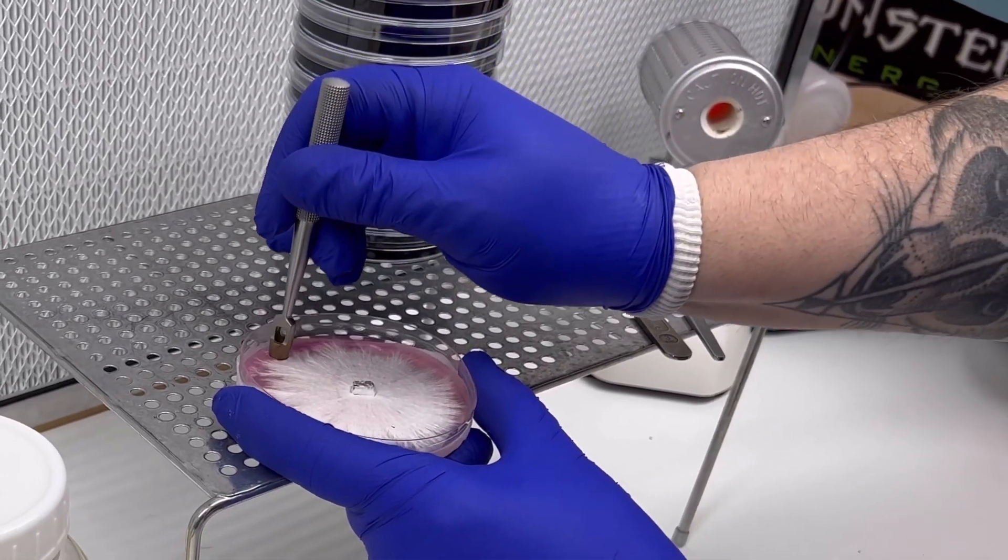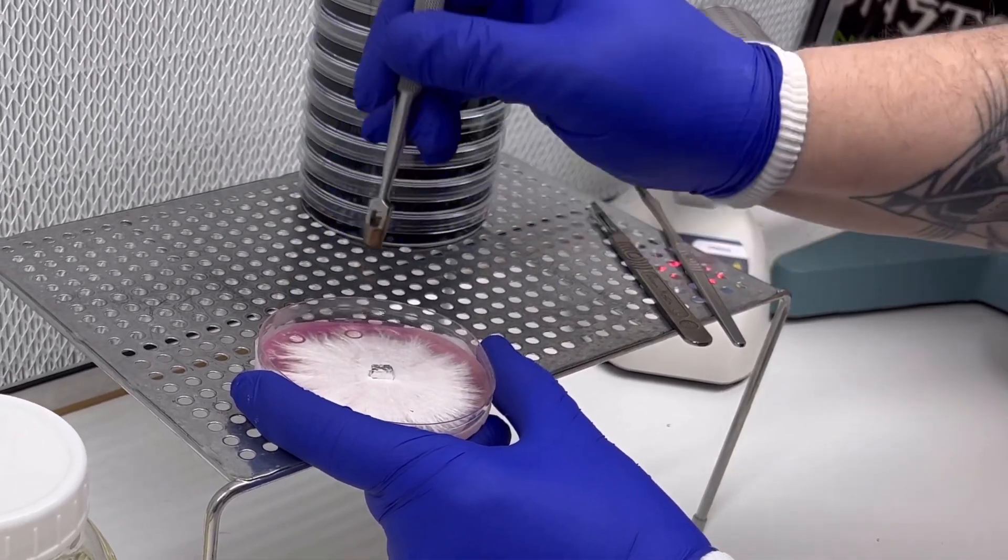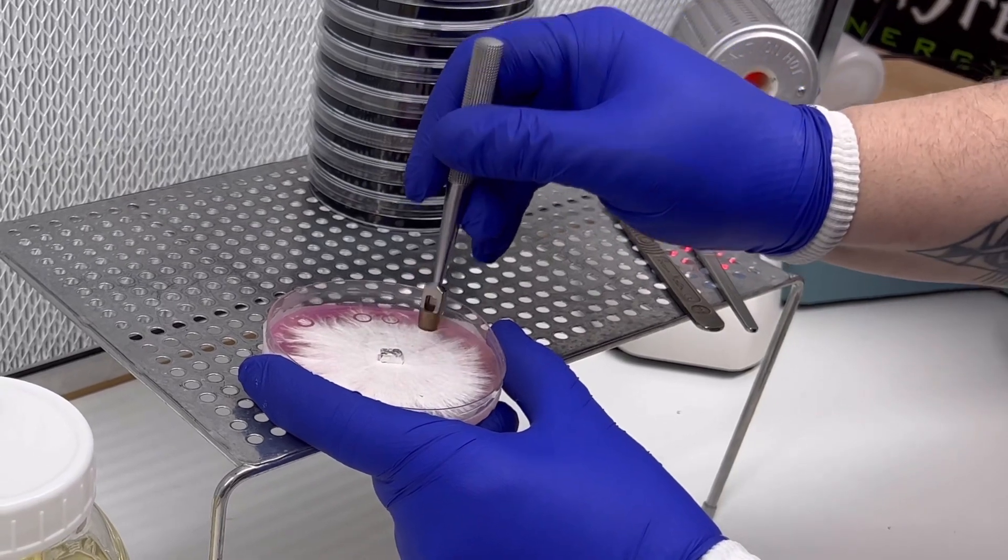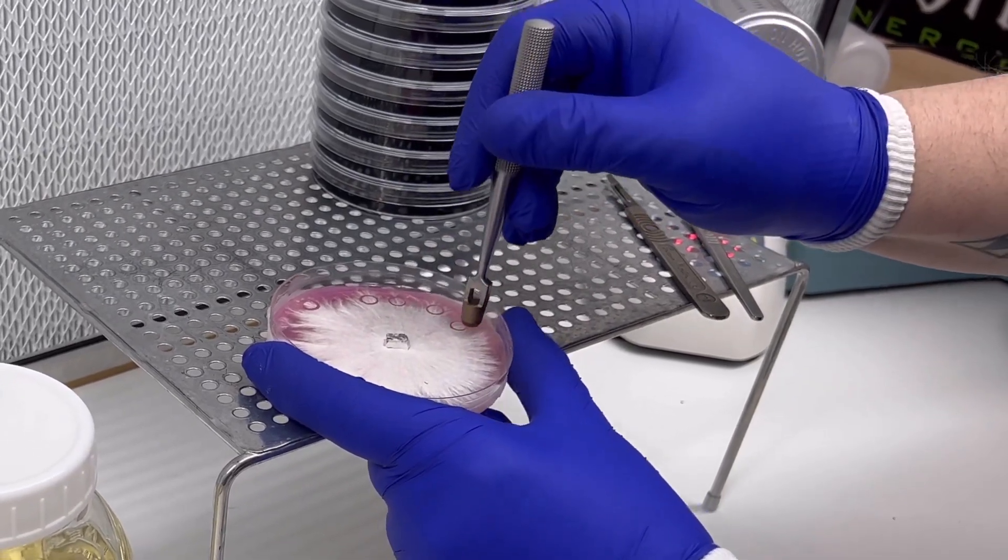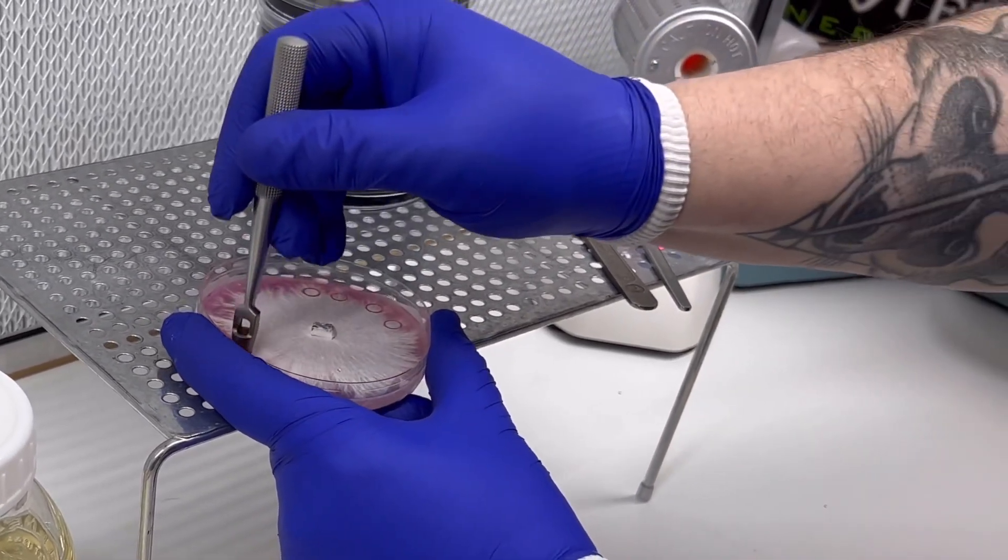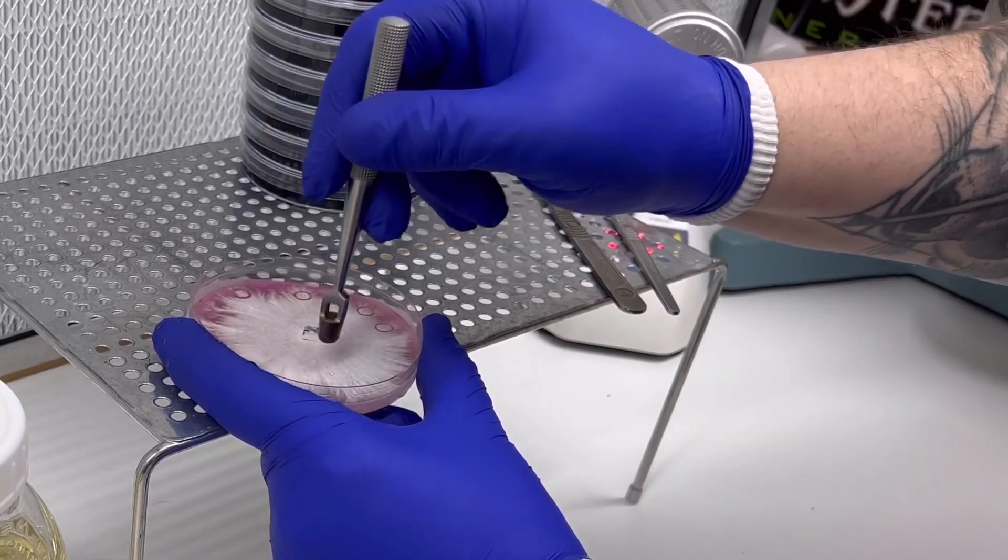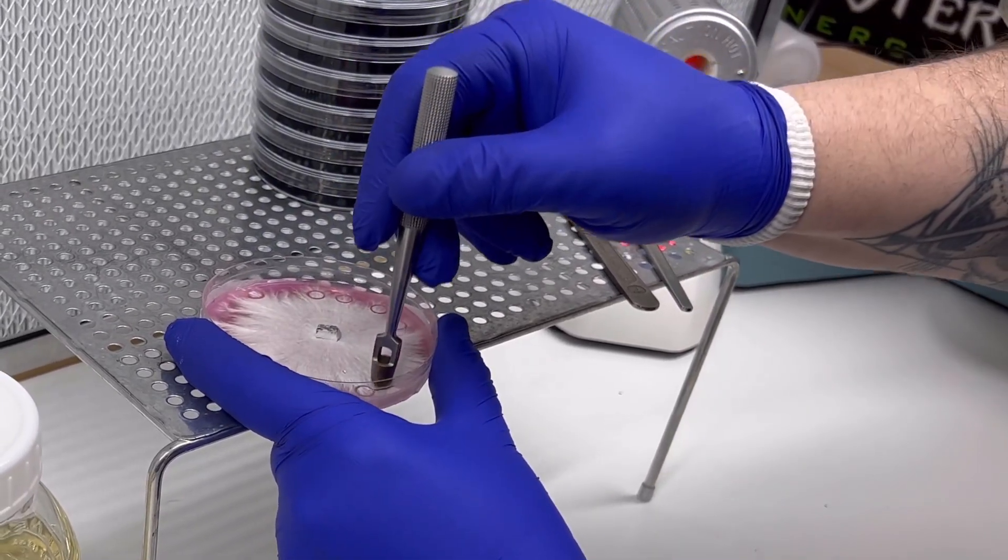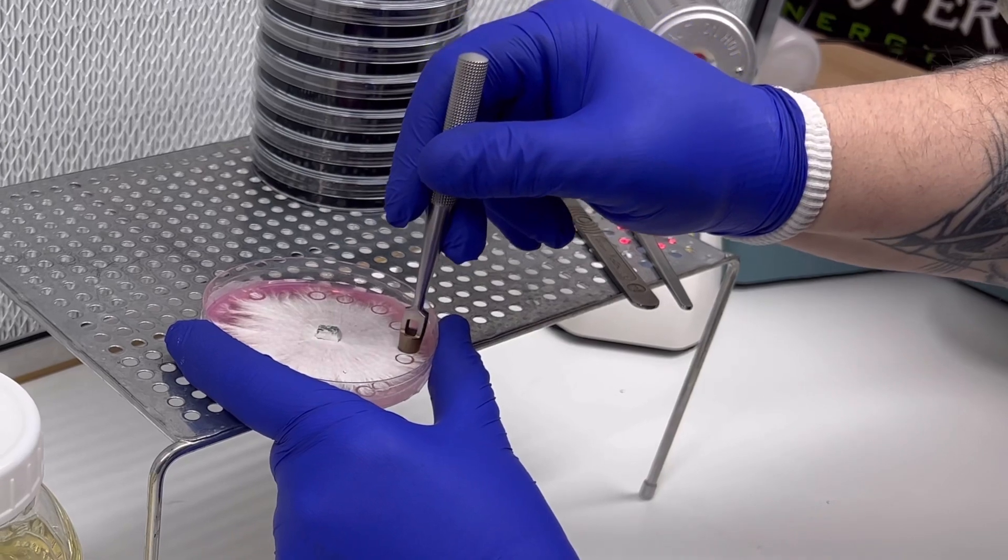We've sterilized our punch in the back decinerator. You can use a flame sterilizer if you want, or just do whatever you can to burn off the bacteria. Then we're just going around the leading edge of the mycelium on the agar and we're punching little holes where we want to take our transfer points.